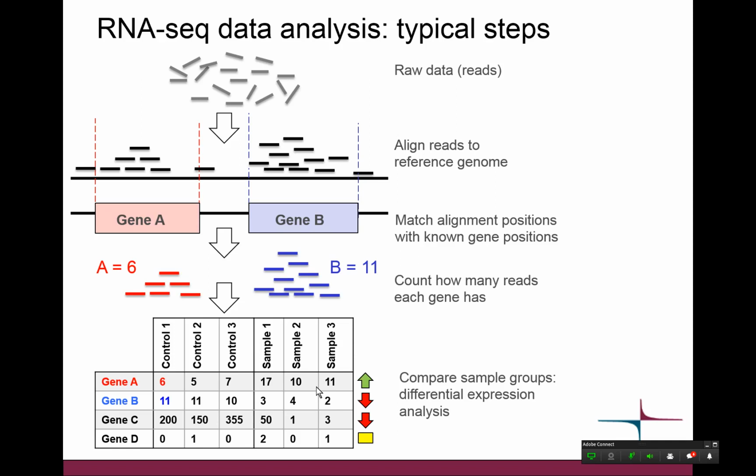And now Maria will continue from here, moving to the actual analysis. Yes, so indeed that was the short description of Chipster, and now we are moving to the actual data analysis part. So this is the really simplified overall analysis steps.